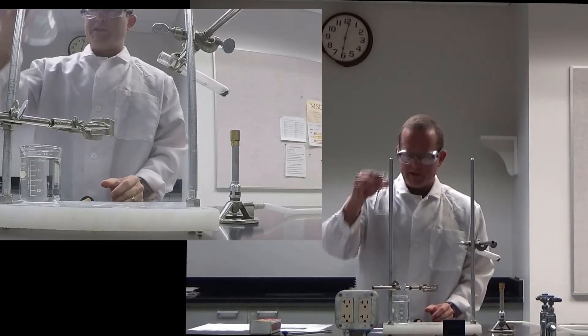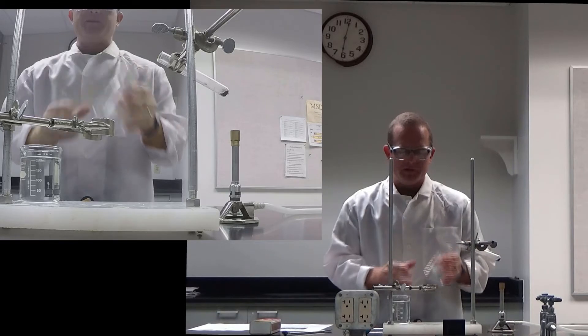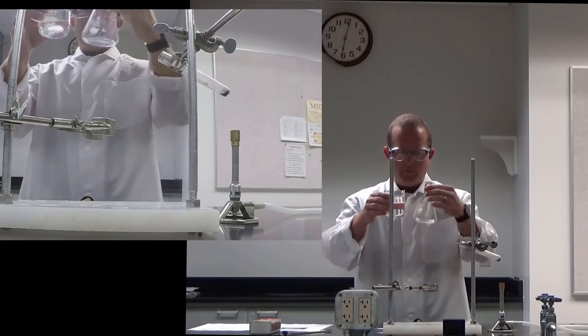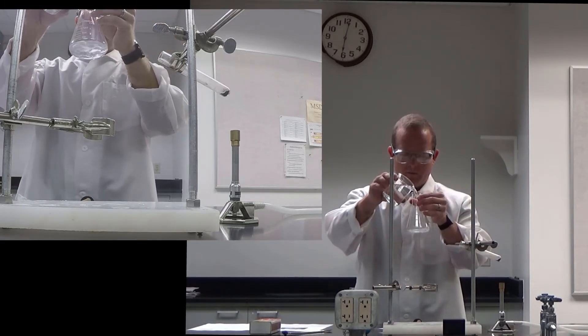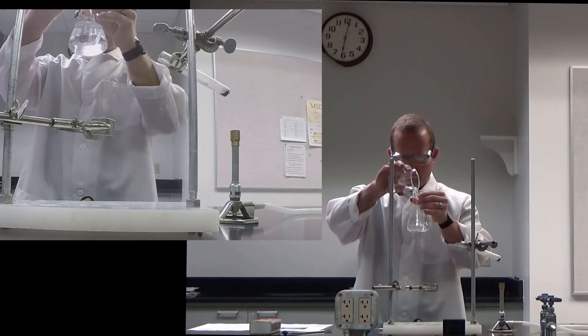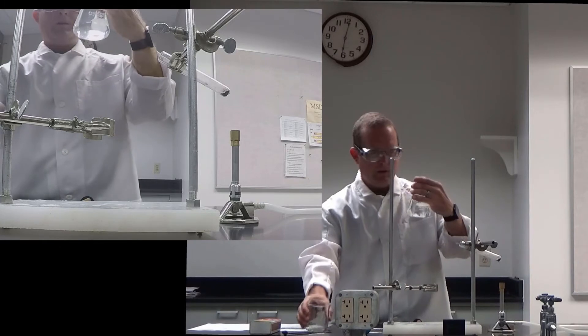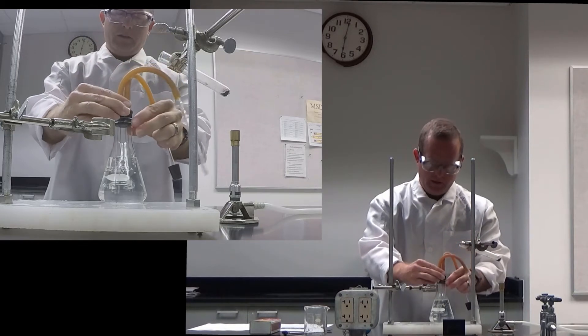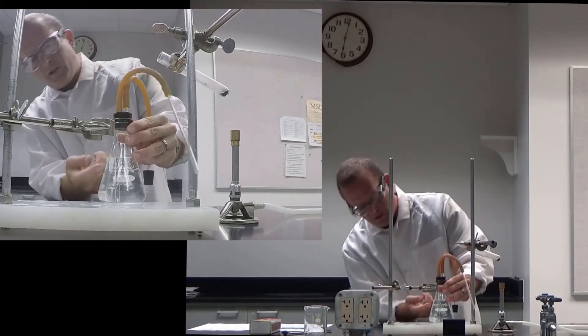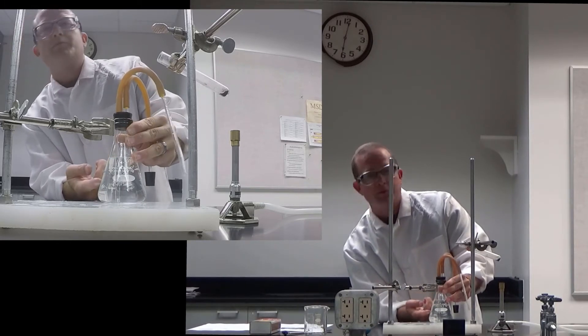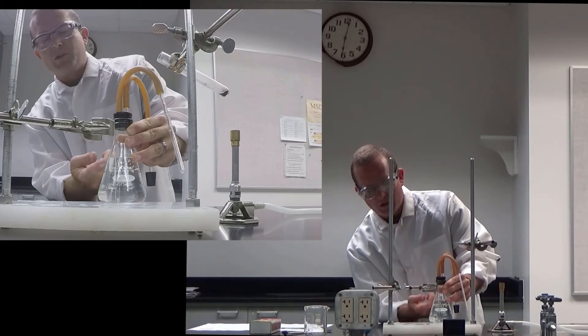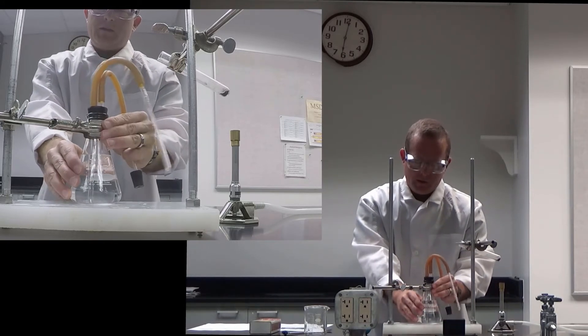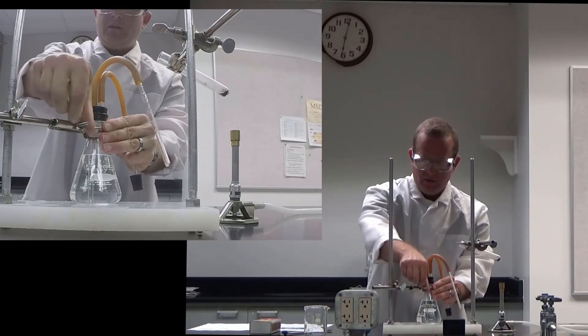Now to set up our gas collection vessel. So we have a 250 milliliter Erlenmeyer flask. Fill that about up to the neck with water. So more than 200 milliliters. The most important thing is that there be enough water in here so that a good amount of it, probably 150 milliliters or so, can be displaced before it hits the bottom of that glass tube there.